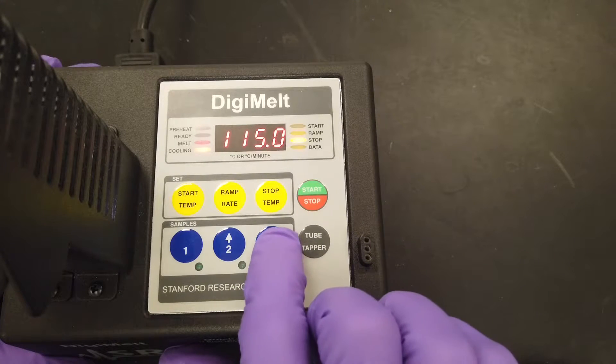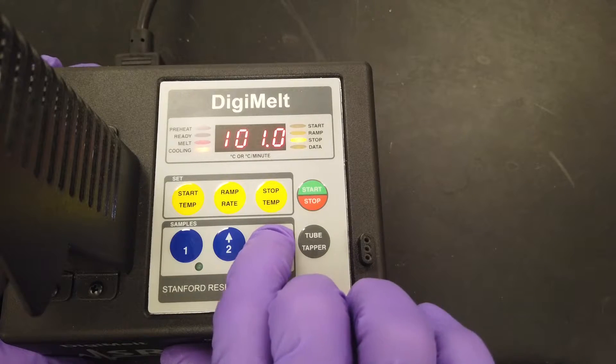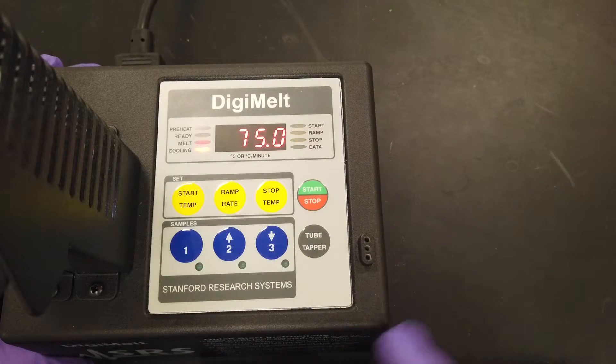Finally, select the stopping temperature by pressing the stop temp button followed by the up or down arrows until you have reached the max temp you expect to need. Press the start stop button to confirm.